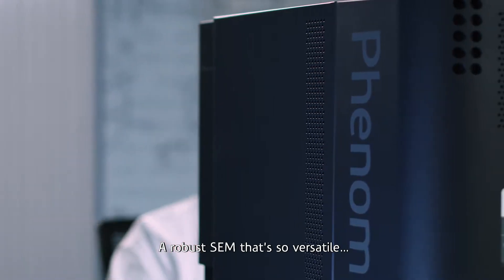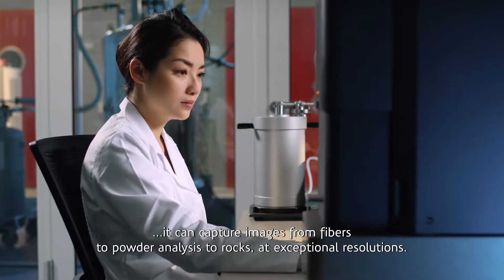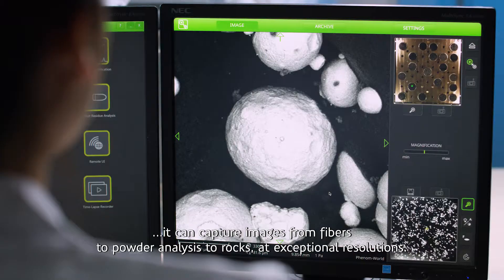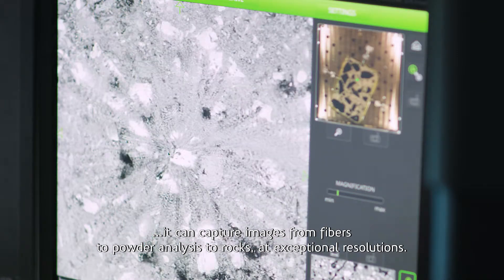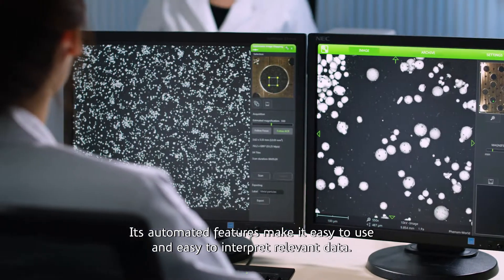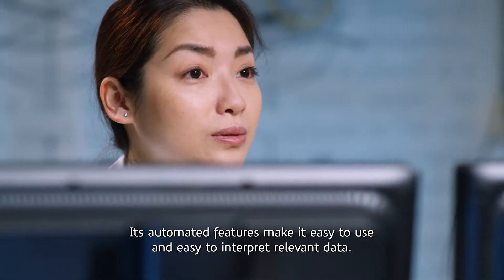A robust SEM that's so versatile it can capture images from fibers to powder analysis to rocks at exceptional resolutions. Its automated features make it easy to use and easy to interpret relevant data.